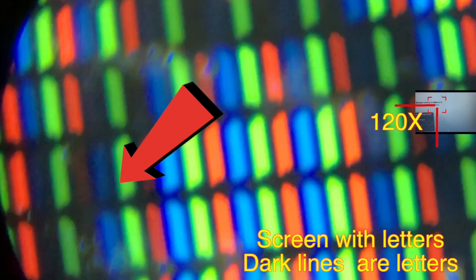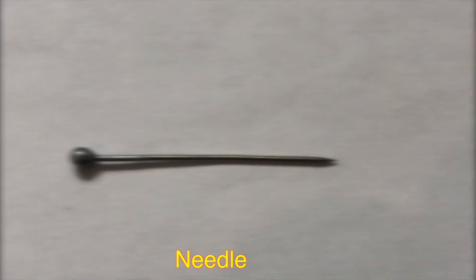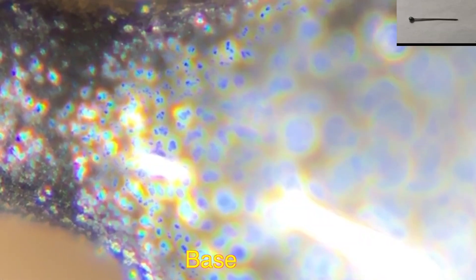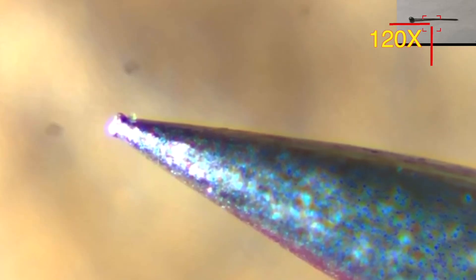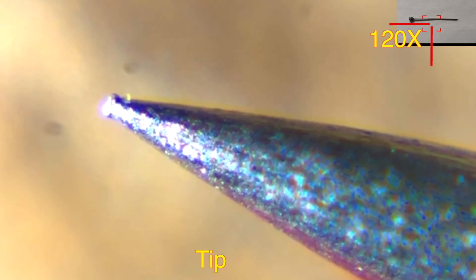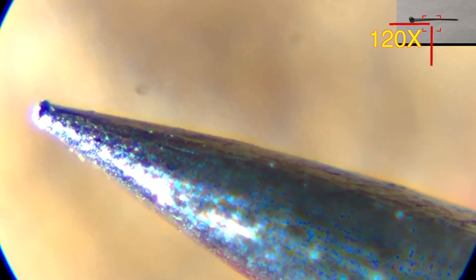Those black line-like things on the screen are alphabets. You can also see a needle under the microscope — it looks like a solid bar. It is pointed, but it doesn't look so pointed under the microscope, even though it still is very sharp to the naked eye.